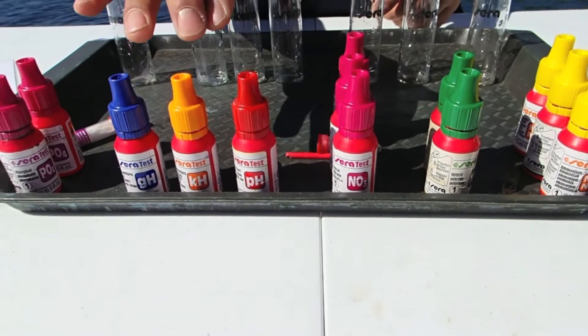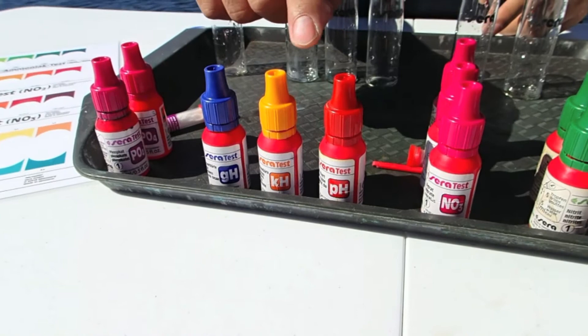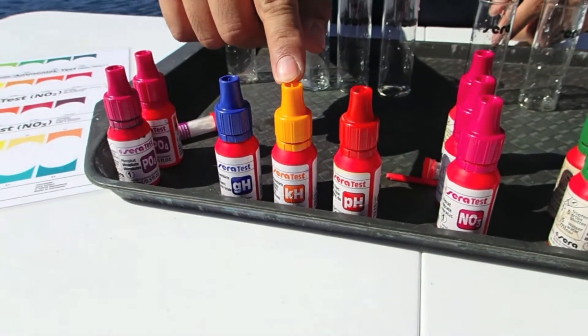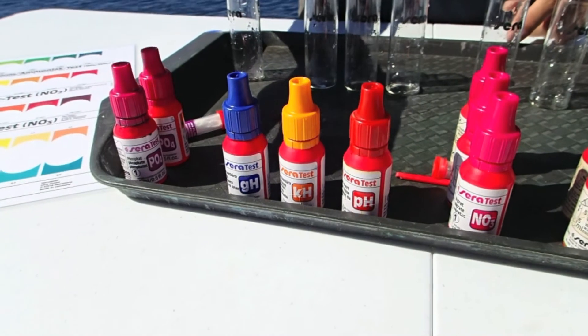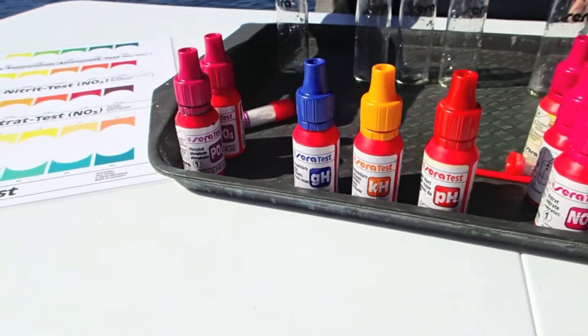The other tests that you would then need to conduct would be your pH test, which is a measure of the acidity of the water. Your alkalinity test, which is also known as KH. And your general hardness, so that's a measure of your calcium and magnesium. And then if they are suffering algae problems, then you would test for phosphate.